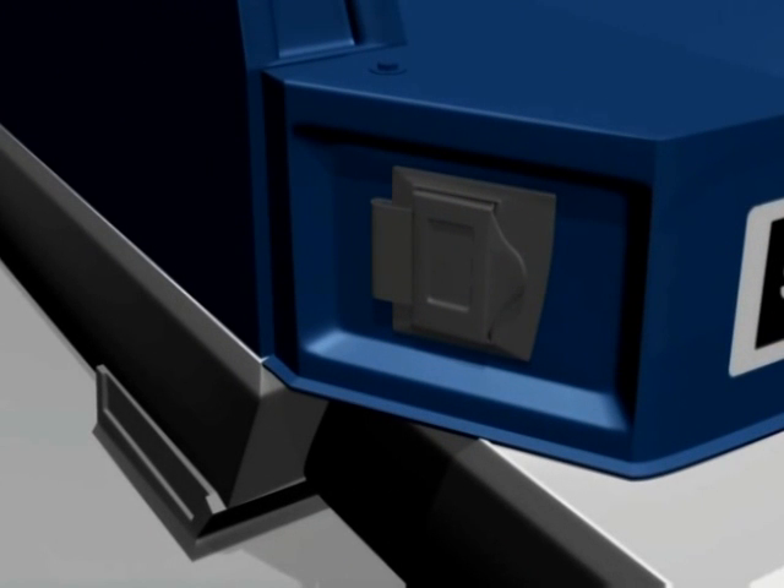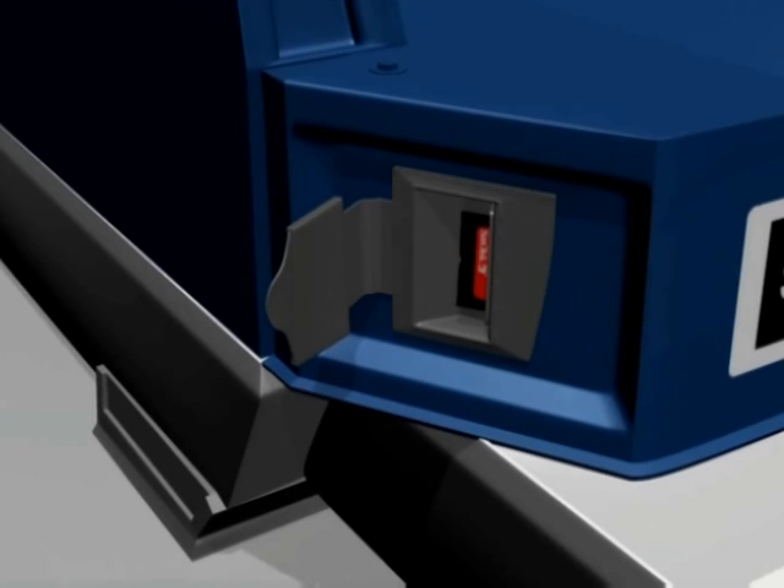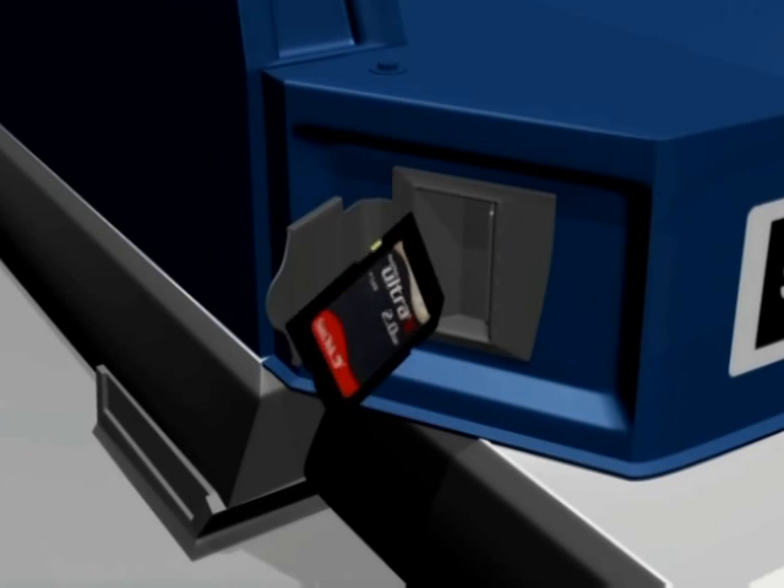The SD card slot has a rubber dust cover that can be opened by pulling the tab on the right side of the cover. If an SD card is located in the slot, the back end of the card will be visible in the slot. To remove, gently push the card about 5mm further into the slot, then release and it will spring out about 20mm. It can then be gripped and pulled out.